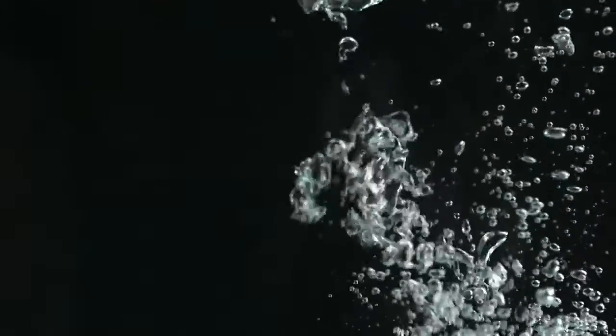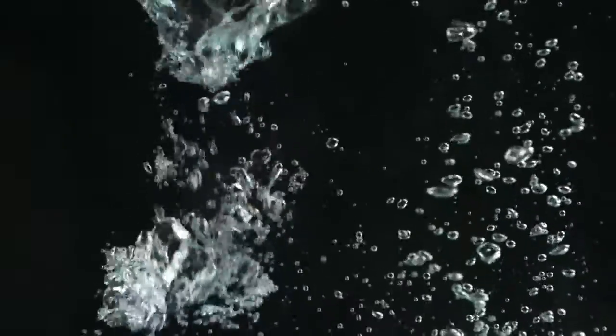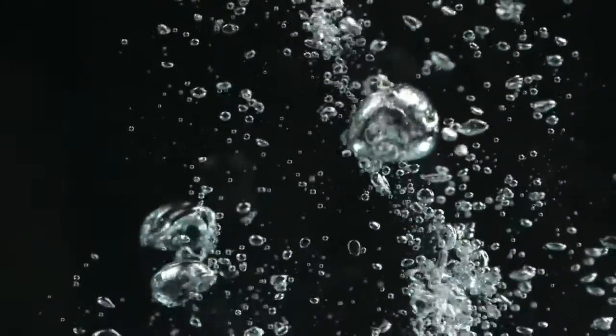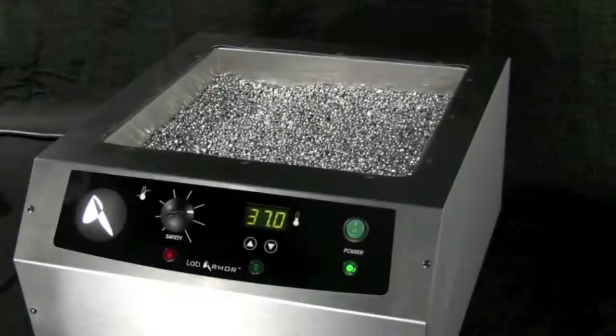It is known that microbes thrive in water, yet water is ever present in laboratories, healthcare facilities, and production and manufacturing cleanroom facilities. Water and ice enter the workspace through various distribution systems and are a component of many instruments. Water carrying unknown biological and chemical contaminants can put a lab at risk and create a complex, unpredictable work environment.